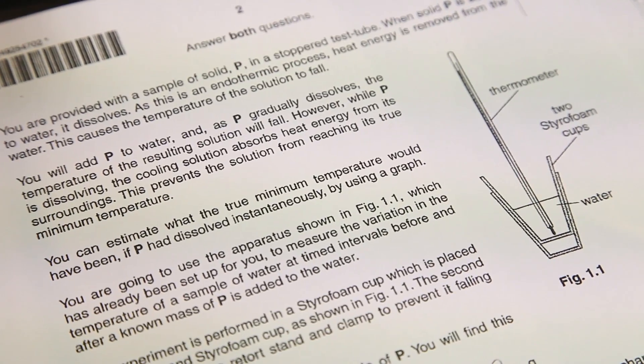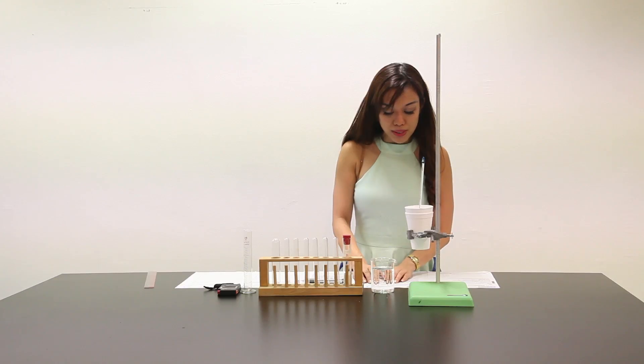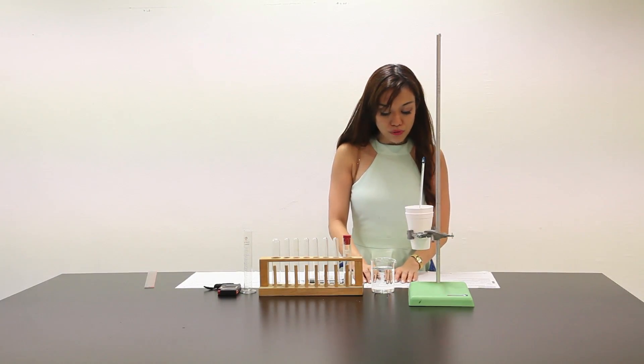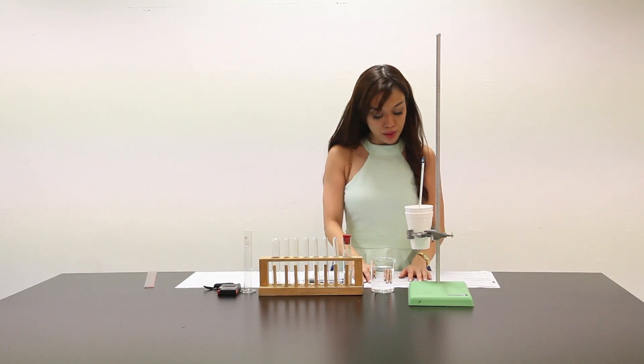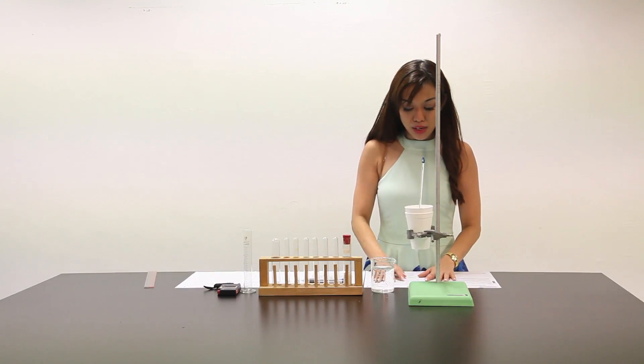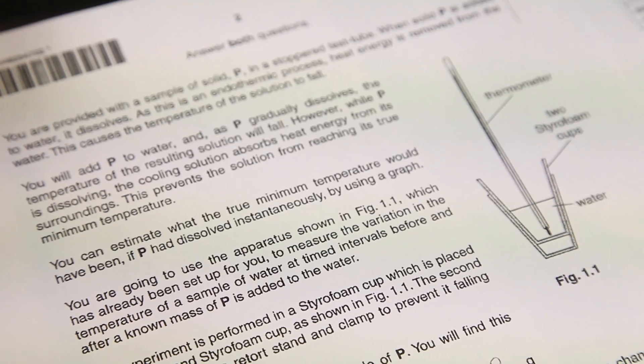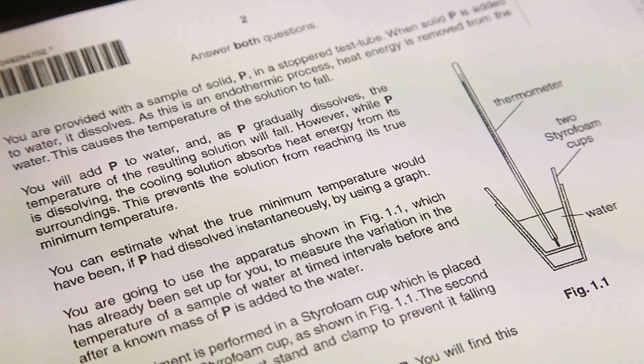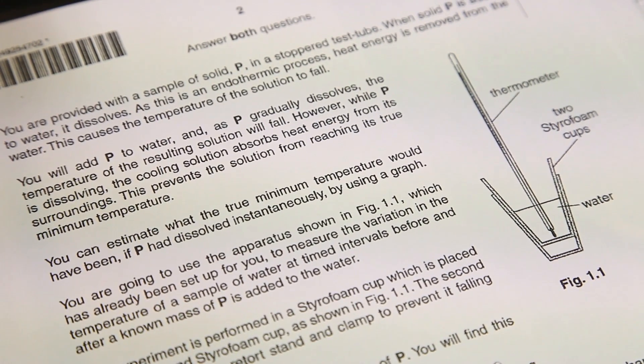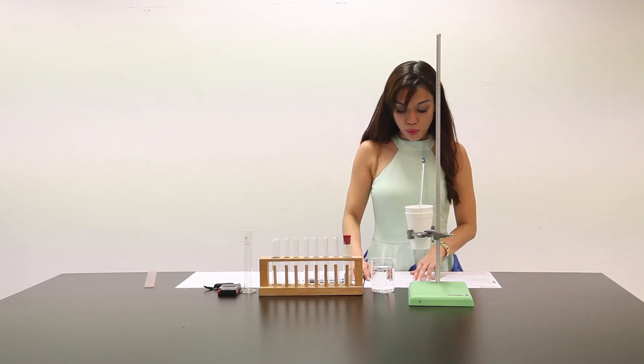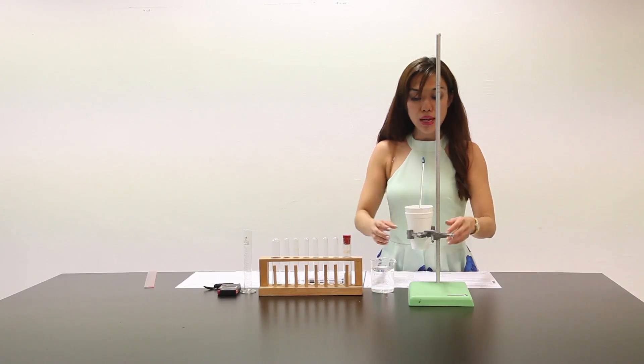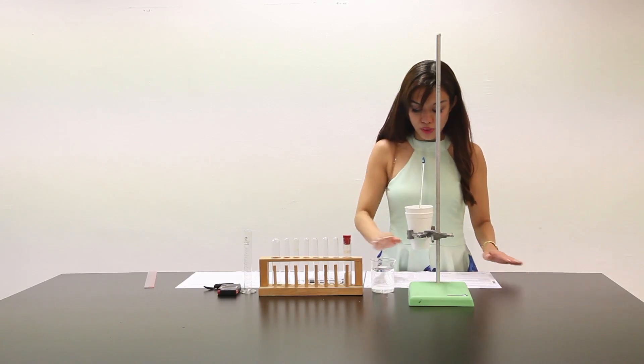However, while P is dissolving, the cooling solution absorbs heat energy from its surroundings. This prevents the solution from reaching its true minimum temperature. You can estimate what the true minimum temperature would have been if P had dissolved instantaneously by using a graph. You're going to use the apparatus in figure 1.1 which has already been set up for you, which is this whole thing here.